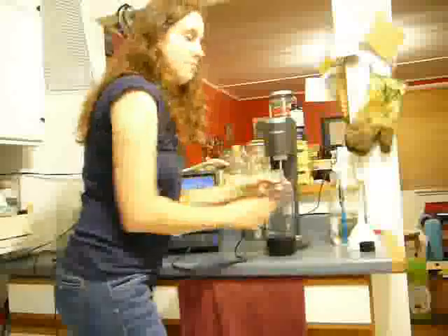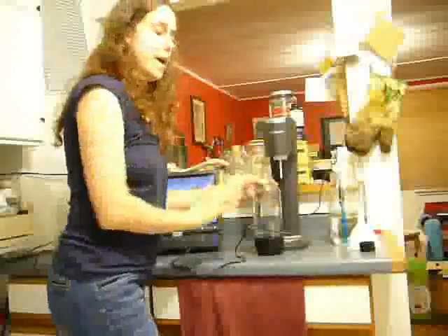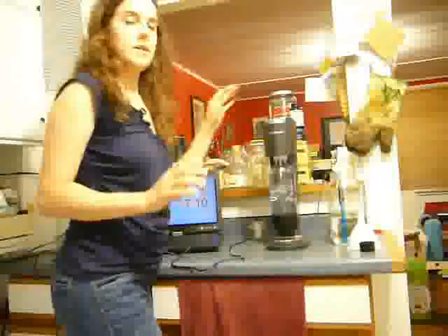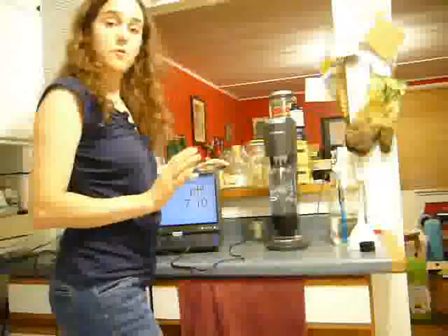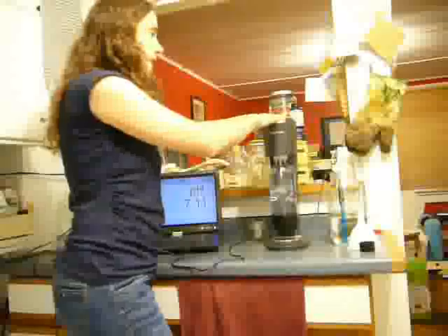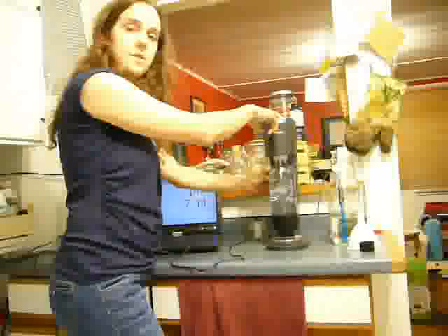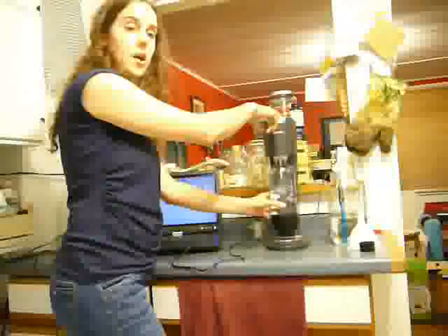And I'm just going to put my probeware there in the same water that I am putting in my bottle. Now I'm going to attach my bottle of water. I'm going to make sure it's very tightly attached so that I don't spray water all over myself and my computer. And this will help release the carbon dioxide from the cylinder in the unit into the bottle.